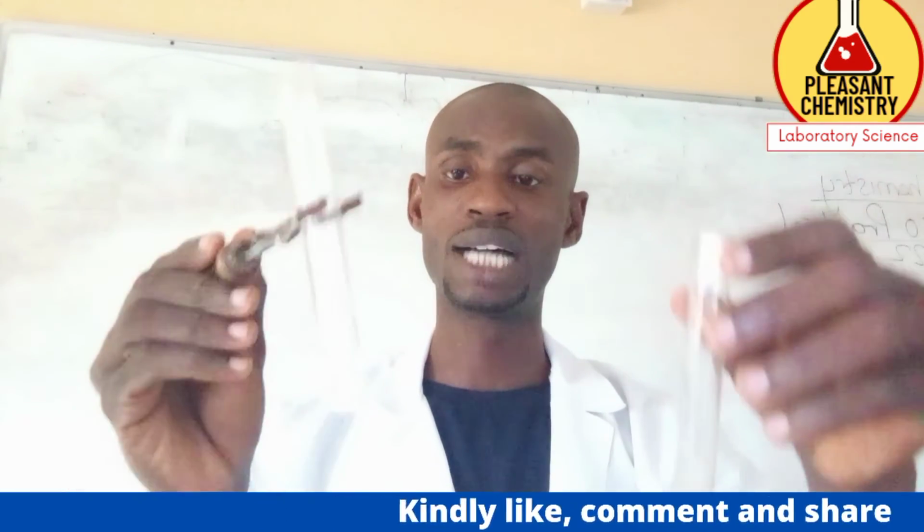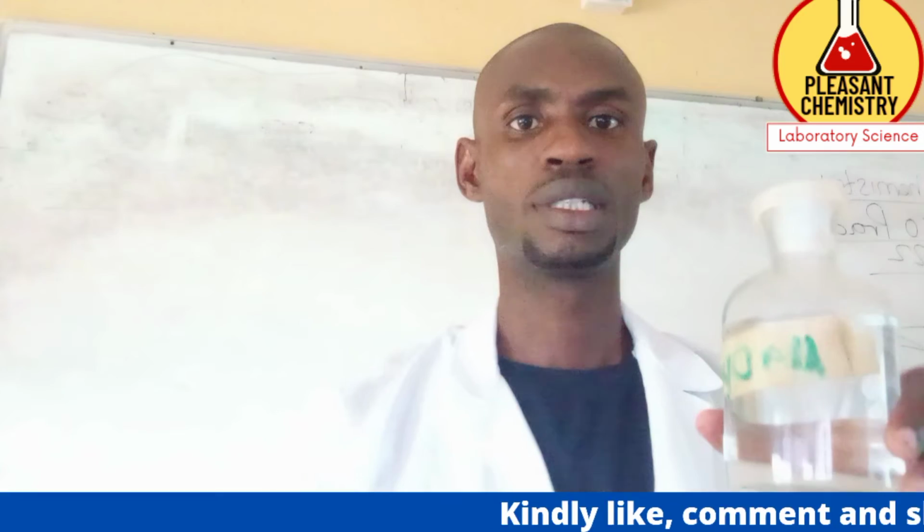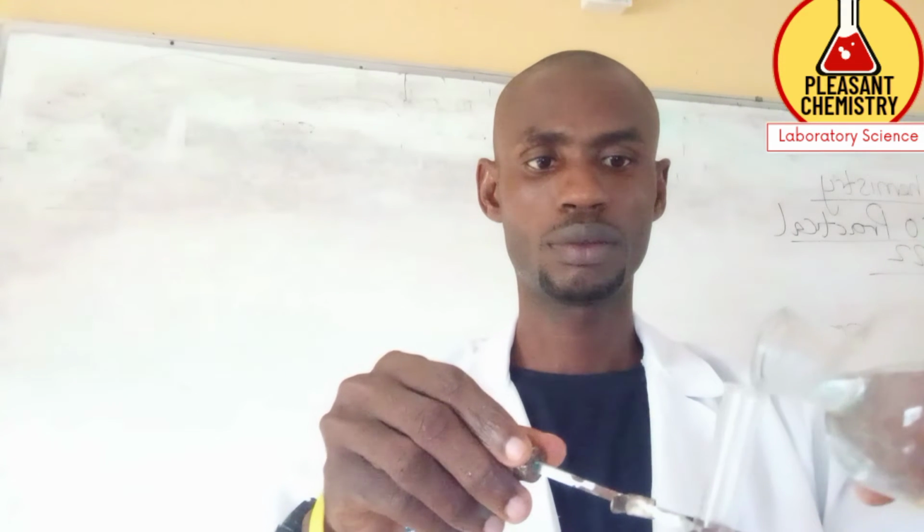Then for the first portion we are adding sodium hydroxide, and for the second one we are adding aqueous ammonia. This is my sodium hydroxide. I'm adding sodium hydroxide to the first portion right now. Because of the screen, I might not be able to see, but there is a white gelatinous precipitate.